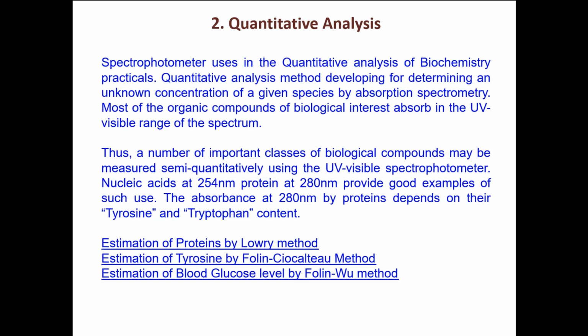So for example, if you have taken 5 ml or 1 ml or 500 microliters of bacterial cells, you have to give the inference that 500 microliters of the bacterial cells consist of this much DNA, right? That's the result. So for that, you have to calculate the amount of DNA present in that particular sample.